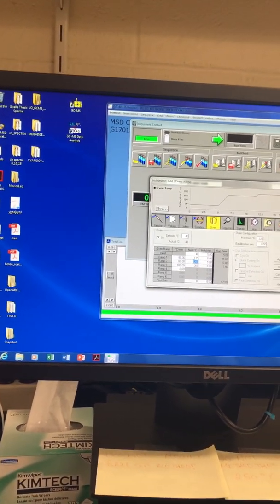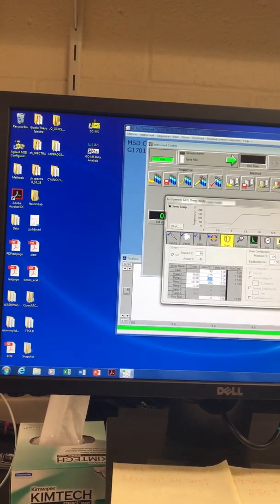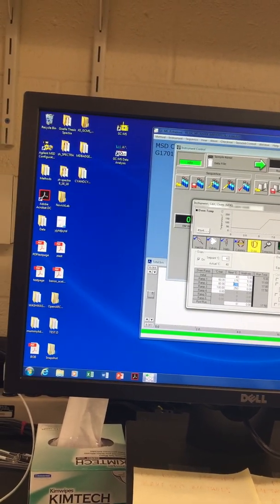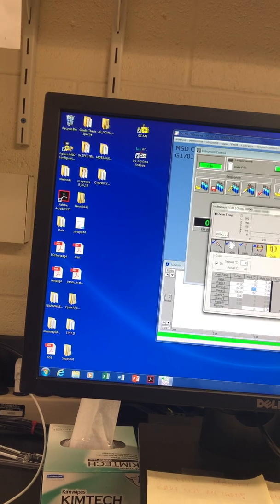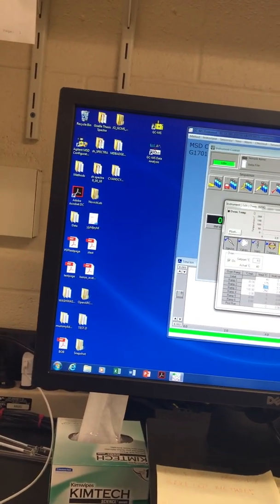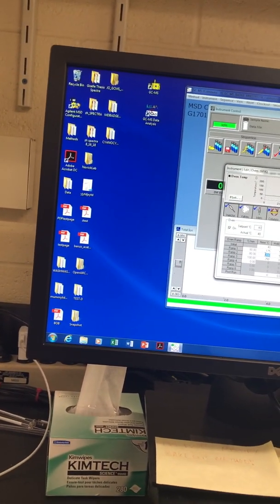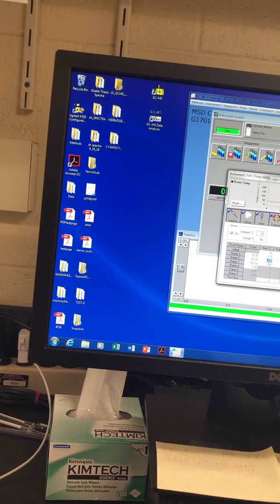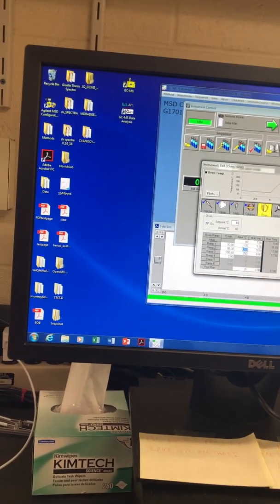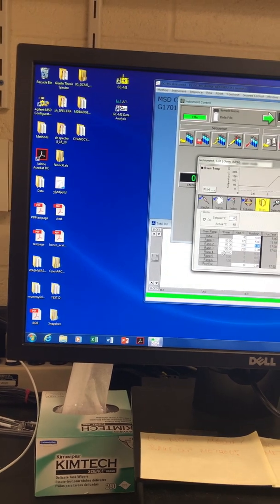So the next analyte that I expect to come off the column would be the 4-bromochlorobenzene. When I ran this analyte by itself through the GC column, I expected it to come off at about 196 degrees Celsius, which is its boiling point. So I set the temperature to about 200 degrees Celsius for 5 minutes so that it would fully come off the column, and it did. So I thought that this was a good temperature to hold for 5 minutes.